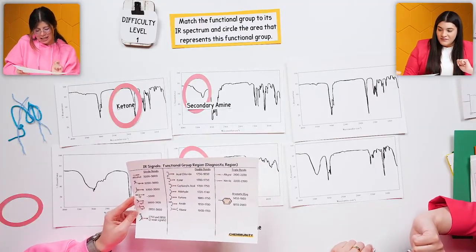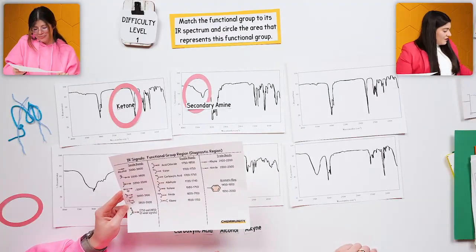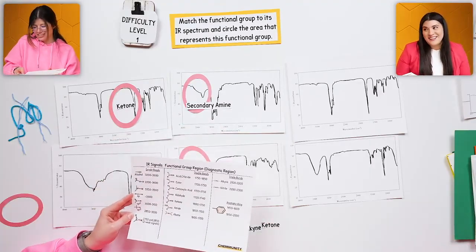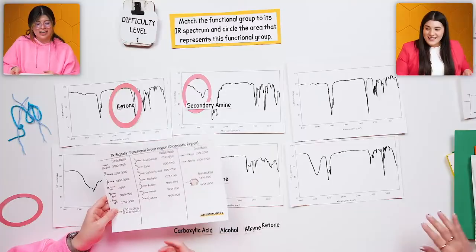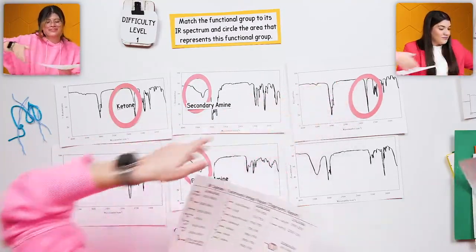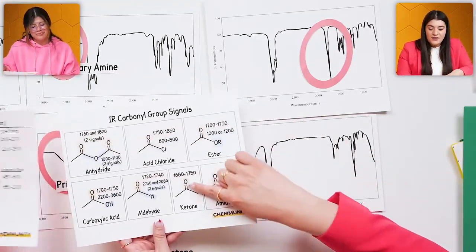I have my little options here. You do. I'm going to add another option. Is it another ketone? It is another ketone. Let's circle it again. Is it because it's one peak? Just one peak. Yep, it was just the fact that I have that one peak.